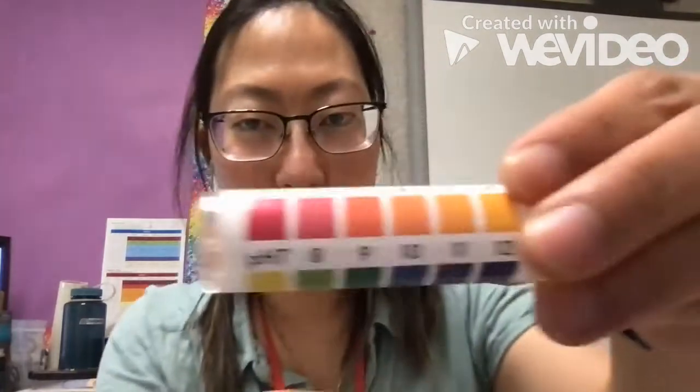Okay, the next one is dry ice in water. So there.